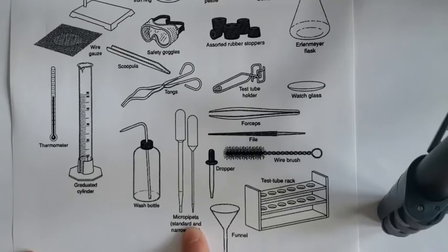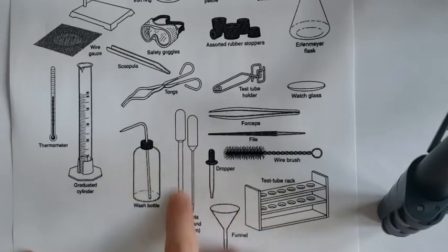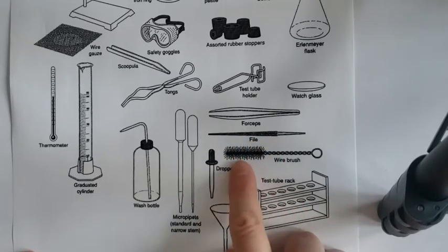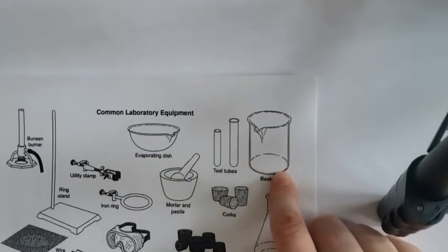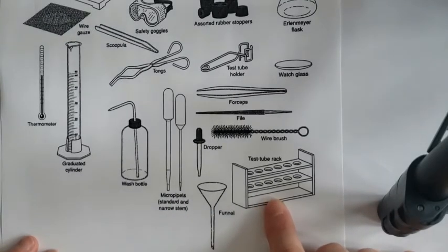Micro pipettes. So it's the same as an eyedropper, except just a little longer. They're plastic. Eyedroppers can be glass. So these two things do the same thing, just to soak up some water and then deliver it to another place. Forceps are like tweezers, a file. I don't think we'll ever use a file. A brush. So there's all kinds of brushes when we do a lab. Some fit inside the beakers, others fit in the test tubes. We also have a test tube rack and a funnel.